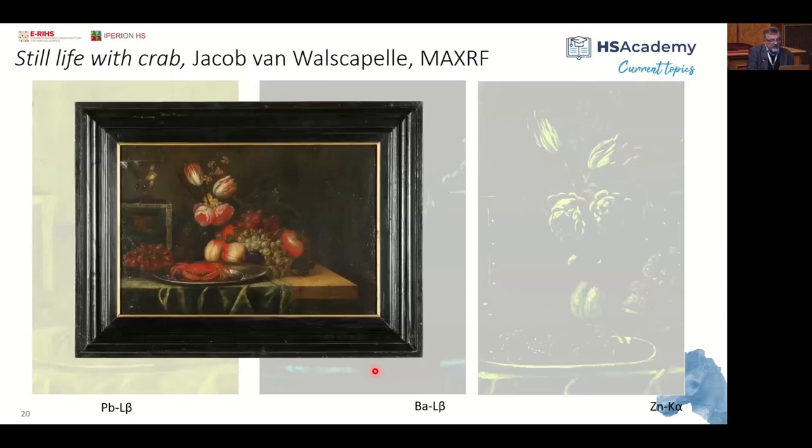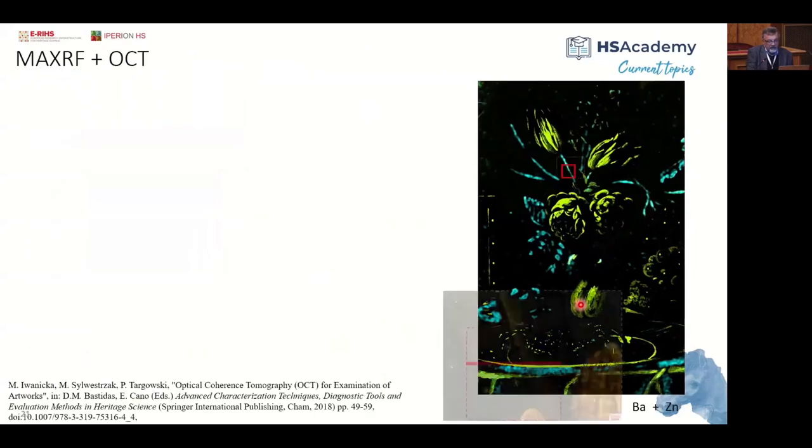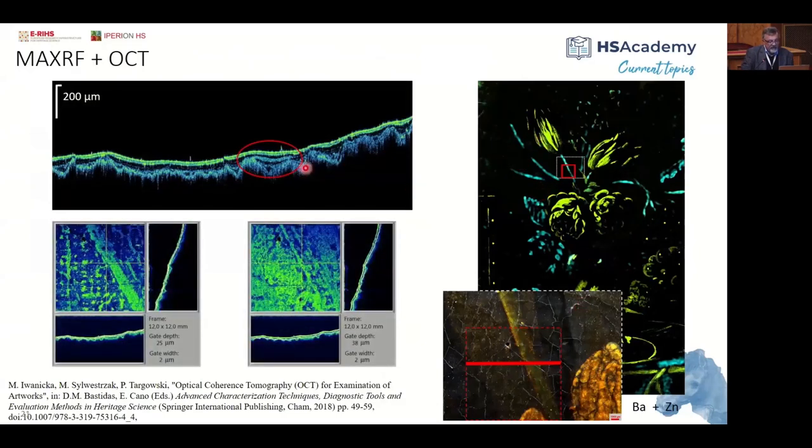This is about another combination of those two techniques. We have this painting which was first analyzed with macro XRF, and we have this scan where this is lead, this is barium and zinc, and we have a lot of structures painted with barium and zinc, which of course was not compatible with the date of the painting. So we had to check if this is original zinc or something added. Again, with OCT we can scan it here. You see we have this specific line, it's this one, and it's visible here. This does not belong to the original paint layer. It is something added after. So obviously we are tracing renovation attempts here with modern pigments, which have nothing to do with the original structure, so must not be taken into account for dating this object.